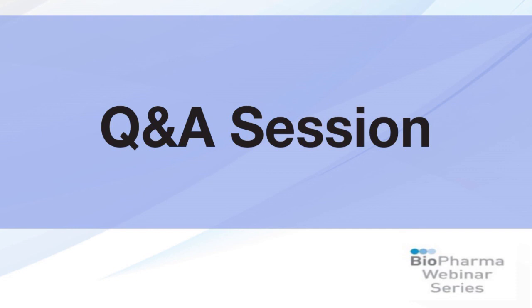Thank you very much. Our next question is for Dr. Zhang and Dr. Zhu. Could you elaborate on how to tell if an identified protein is a true HCP or a false positive ID?